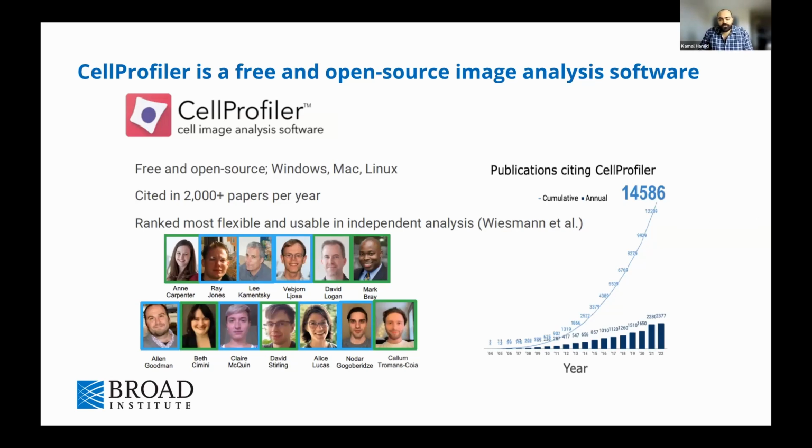The development of this software started about 2 decades ago, started with Anne Carpenter, and ever since it has accrued a quite substantial number of citations, and it's been described as one of the most flexible and usable softwares in independent analysis. But of course, CellProfiler is great, but it's not the only software out there for this sort of purpose.